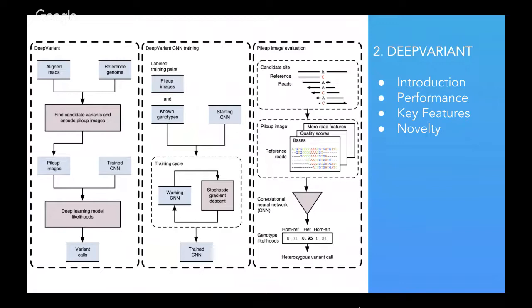From those images, the information that you can capture is of course the alleles and the positions. And this might help to extract from all these images certain more complex patterns that would otherwise be quite difficult to extract with some other statistical model.